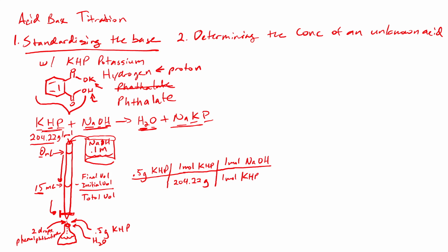Okay, and so that's great. The reason why that's great is because when you get moles of sodium hydroxide, you can then use the volume of sodium hydroxide that you put in there to figure out what the concentration of sodium hydroxide is. So let's do this math real quick.